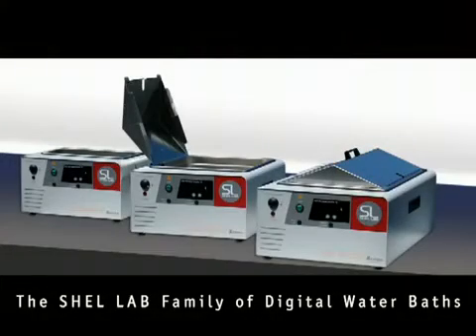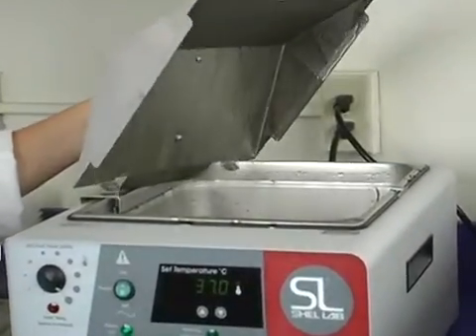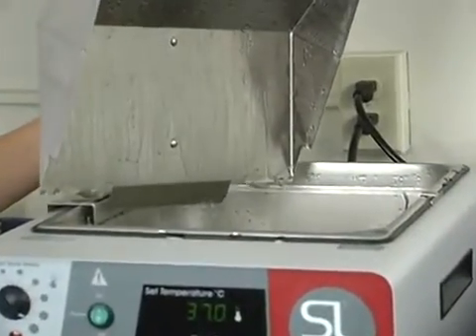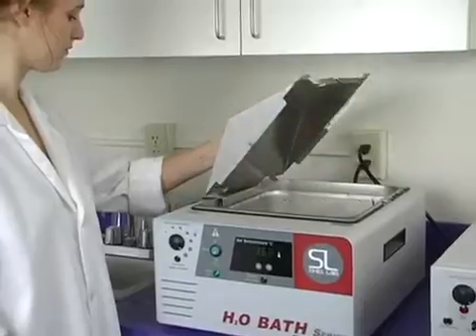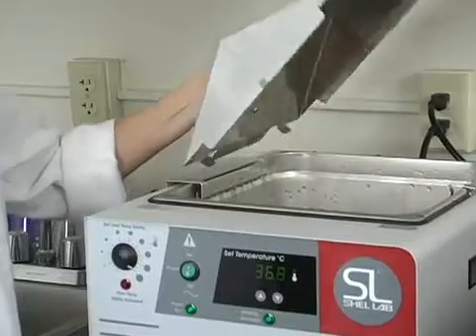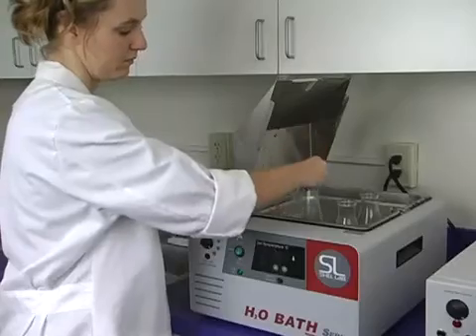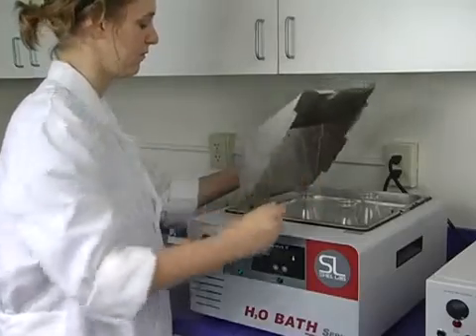The Shell Lab family of digital water baths has been engineered using decades of feedback from our customers. Our baths include a stainless steel lid designed to force water droplets from condensation back into the bath. Each unit features a lid holder that allows condensation to flow directly into the tank rather than spilling onto the lab bench. The stainless steel lid also accommodates a variety of flask sizes.